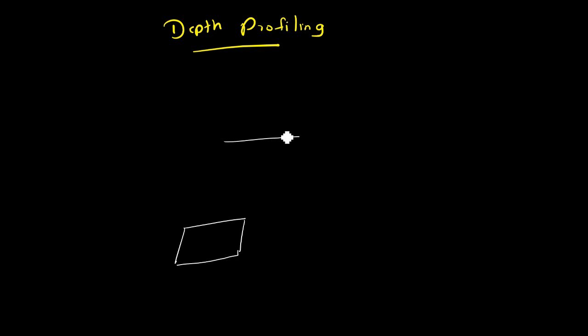What sort of materials are on the surface, and then after a few angstroms, like 40 angstrom in depth of the material, what is the composition? Again at 100 angstrom depth, what's the composition? 200 angstrom depth, what's the composition? Likewise, we are going to see the elemental composition inside our sample.